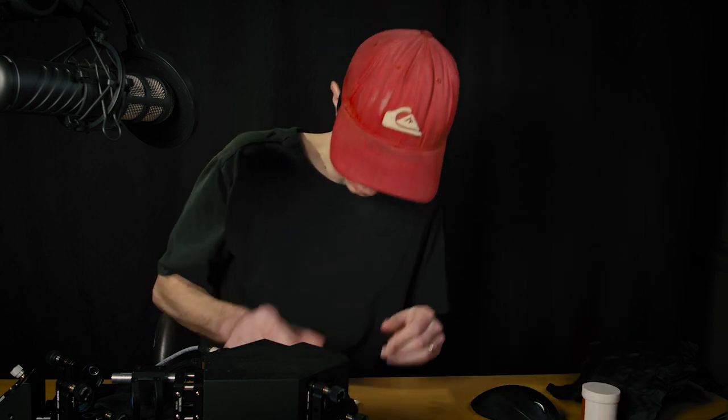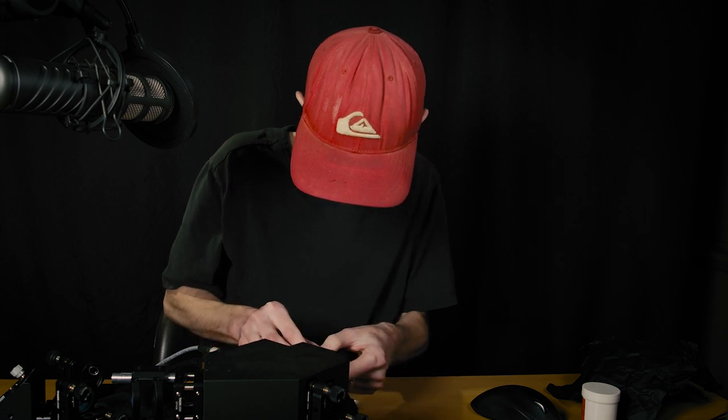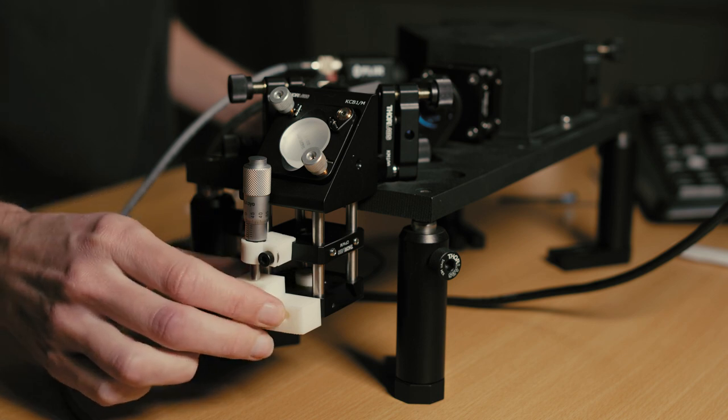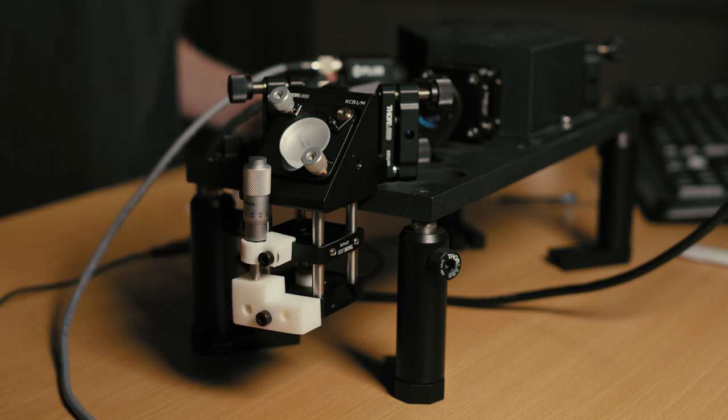You just want to tap a little bit so that it's even. I will place the sample and switch on the laser.